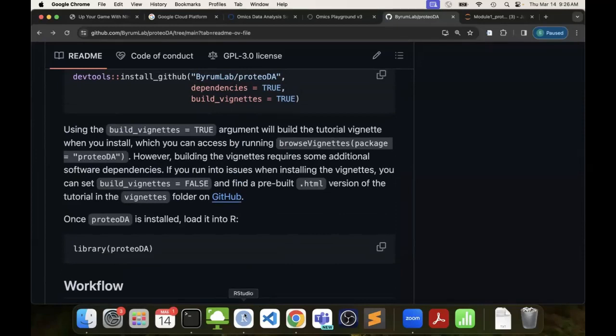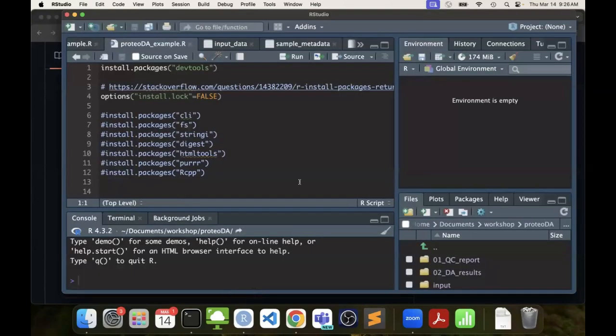Can I ask another question? Yeah. My quick question is, I trust you to do this a lot more than I trust myself to mess around with it. So why would I ever go in and want to do anything other than stare at the Excel files, which you know I do? Usually this is students, postdocs, somebody who wants to learn R, and you have a lot of different comparisons and you want to investigate something else, and I can't get back to you that fast. Yeah. But it is nice to know what's happening behind the scenes a little bit.